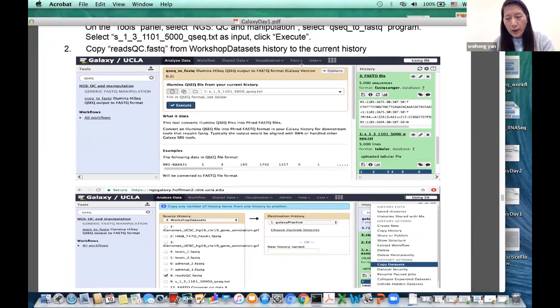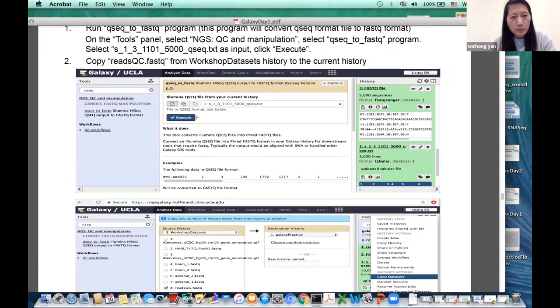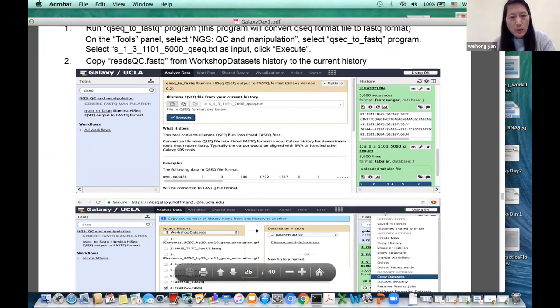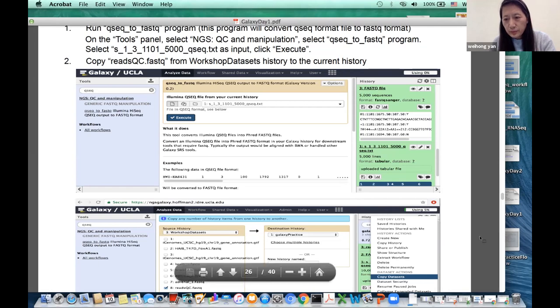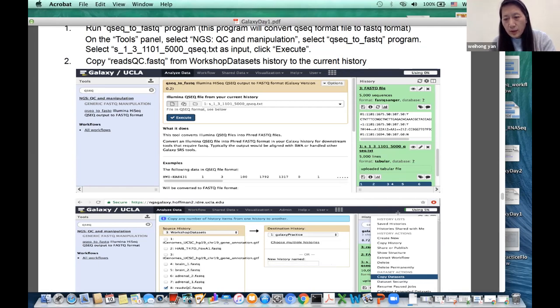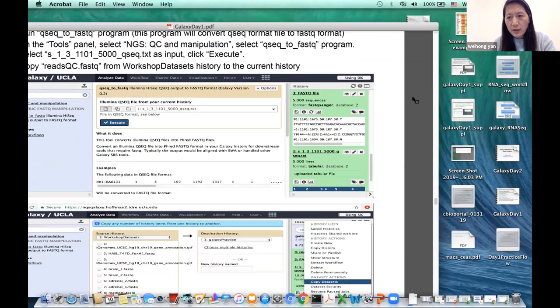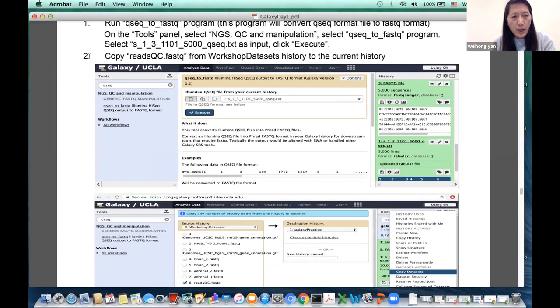Yesterday we stopped when we tried to run some quality control. Today we will start from here and continue to the RNA-seq analysis. Any questions about yesterday's workshop? Everybody seems okay. Let's go to the Galaxy web interface now. We will start from step two.